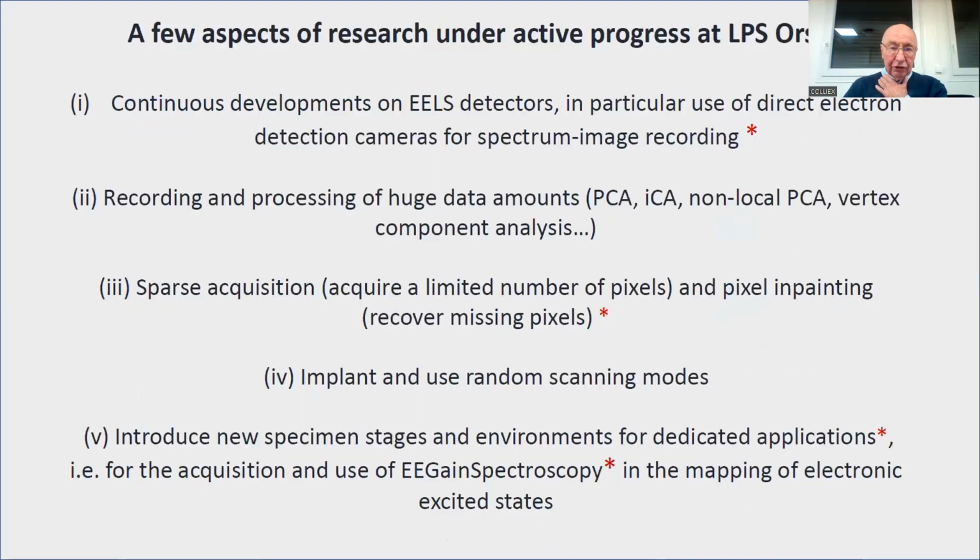So now we are close to the end of the talk. What are we doing now in Orsay? There are many studies, many developments basically on detection and processing of spectra, because as you have understood, we have moved from an era where one spectrum was okay. Now we have millions of spectra every day. So there is a need for computer assistance and development of computer assistance. So these are a few lines of work now.